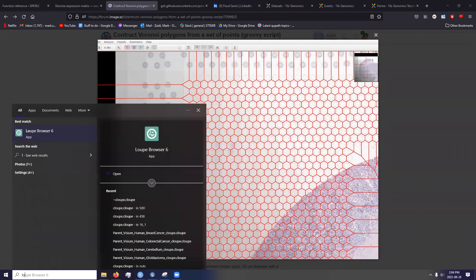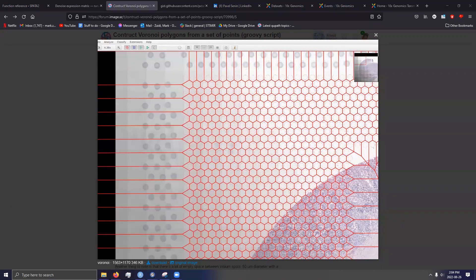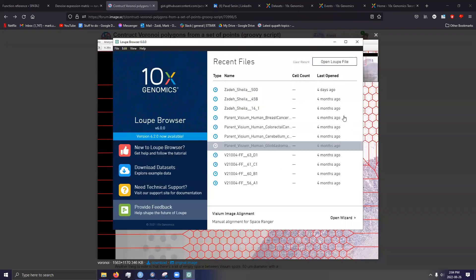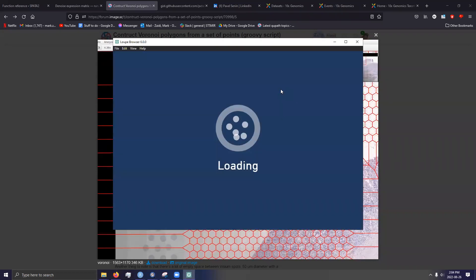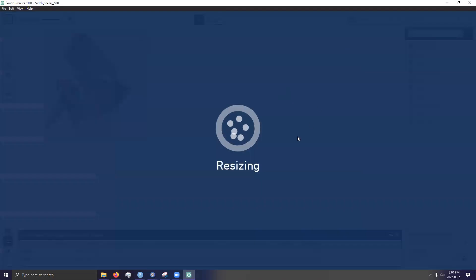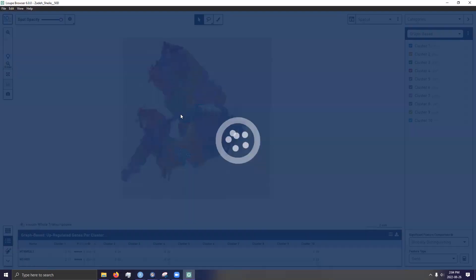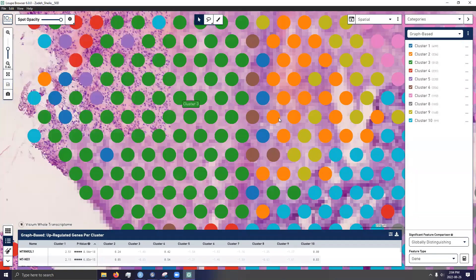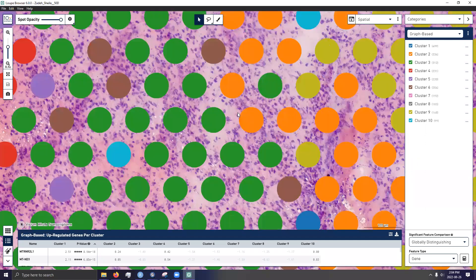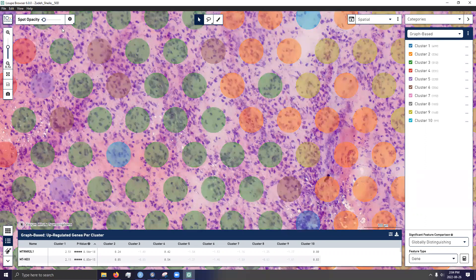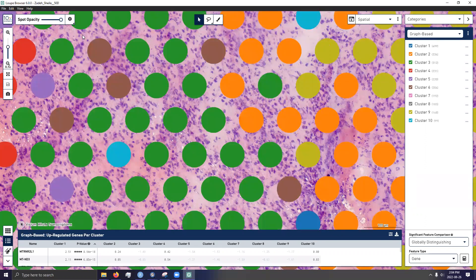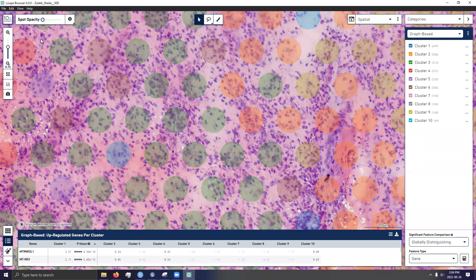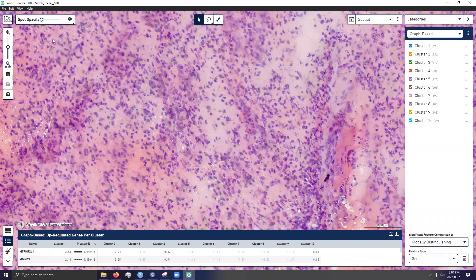In fact, if I open the Loop browser, which is kind of just a free 10x tool for quickly looking at Visium data, and I zoom into a tissue section, there is a lot of empty spots or empty space around the spots. I believe this current version of Visium has spots with a 50 micrometer diameter.